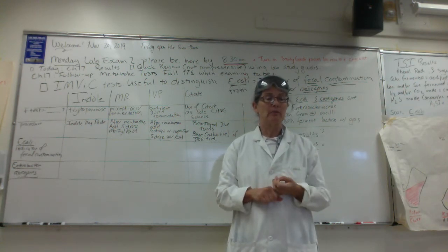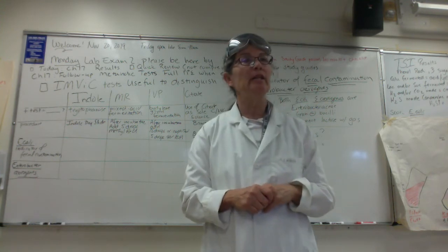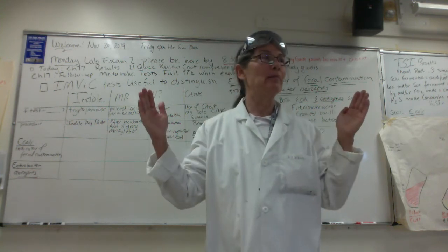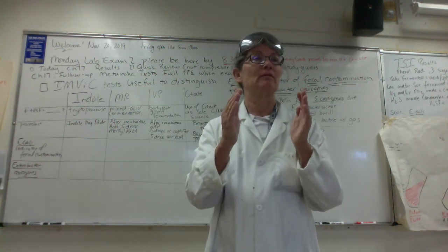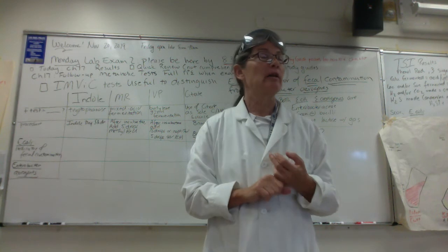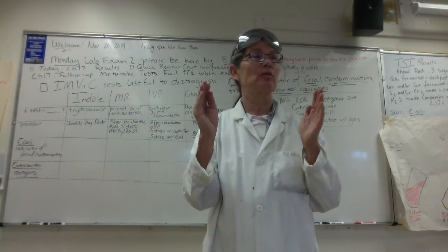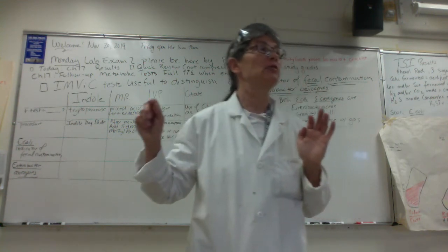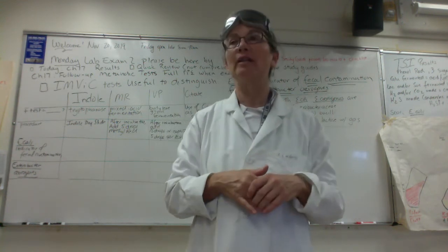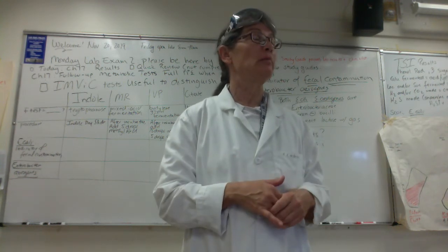So folks, if your microbe carried out that butylene glycol fermentation, there will be a unique intermediate. The long name is acetylmethylcarbinol. The short name is acetoin, right? So if your microbe carried out butylene glycol fermentation, it should make acetoin. When we add our alpha naphthol and 40% potassium hydroxide, within 30 minutes a red color will develop. So again, you guys, red is a positive VP test.